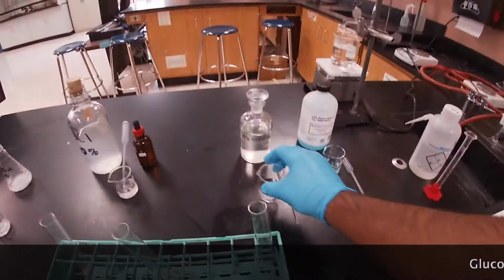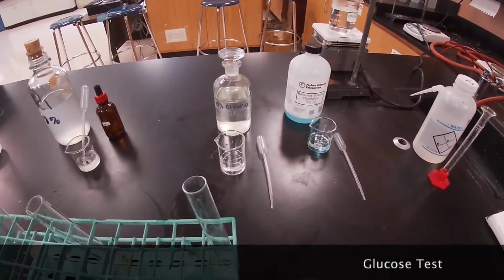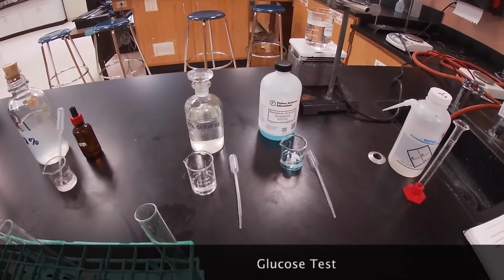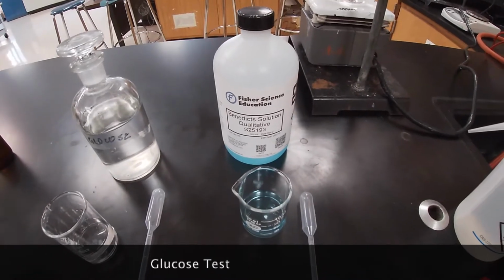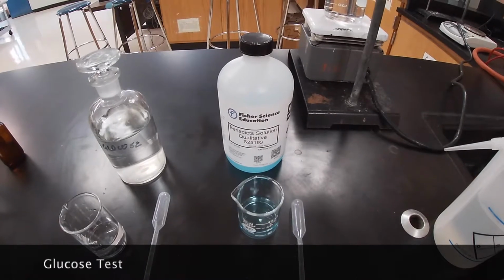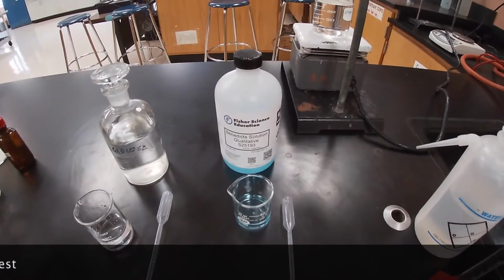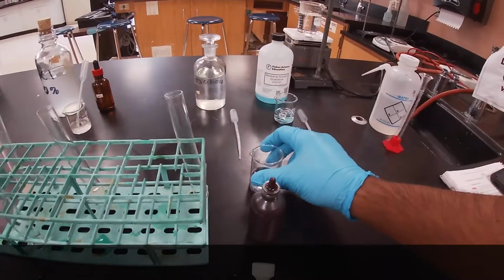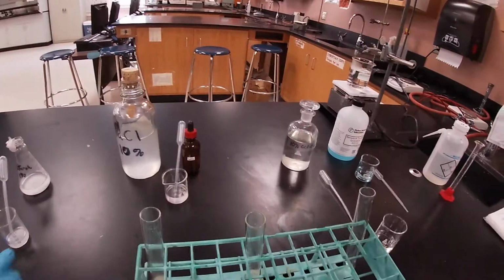The next test that we're going to do is the glucose test. And so for the glucose test, what we're going to do is add 3 milliliters of our glucose solution, 10%, and then we're going to add 3 milliliters of our Benedict solution. And then we're going to place the test tube in a water bath and heat for about 5 minutes, and then we're going to record our observations, all right, to determine our positive test results for glucose. So we're going to get our glucose solution. Let's go ahead and get rid of our iodine solution.